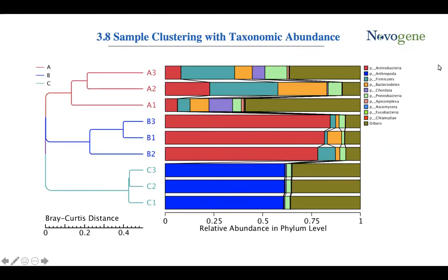In order to study the similarity of different samples, it is also possible to construct a cluster tree of samples by performing cluster analysis on the samples. The Bray-Curtis distance is the most commonly used distance indicator in hierarchical clustering. It is mainly used to describe the similarity between samples, and its size is the main basis for sample classification. So starting from the gene abundance table in each sample, the Bray-Curtis distance matrix is used to perform cluster analysis between samples.